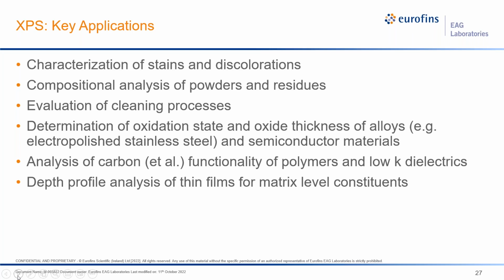So polymers are often the samples that we analyze, as well as low-k dielectrics. Like in TOF-SIMS, we can do depth profiling using ion beams to analyze thin films and stacks of films.